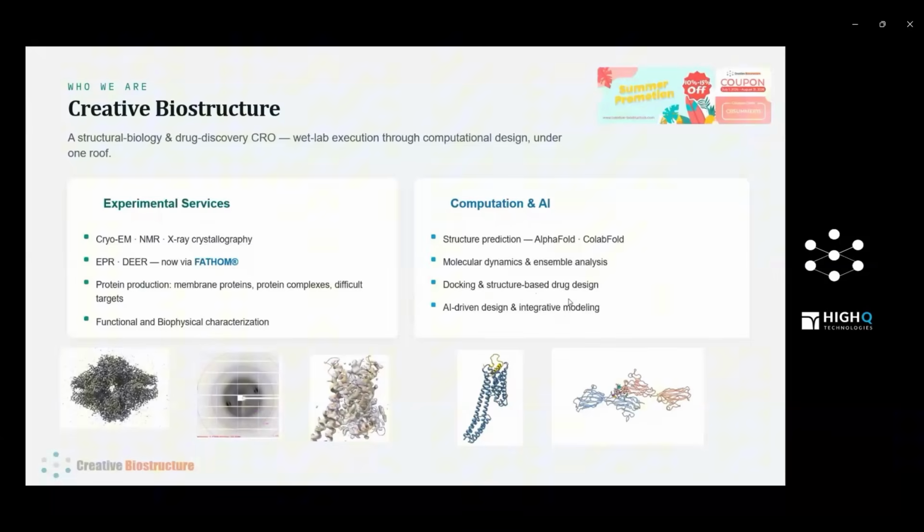Crystallography gives us superb resolution, but it needs protein to hold still. Flexibility works against it. NMR reports on dynamics and does it well, but it's limited by molecular weight. Past a certain size, it becomes very difficult. Cryo-EM is where most of the attention is, and deservedly so. But anyone who has processed a data set knows what happens to flexible regions. They blur, they average out. Sometimes they simply aren't resolved. So there's a real gap, and EPR fills it.